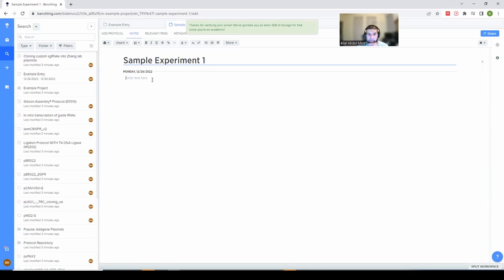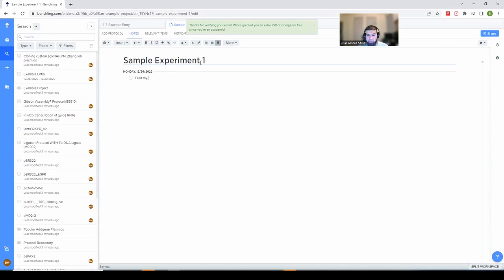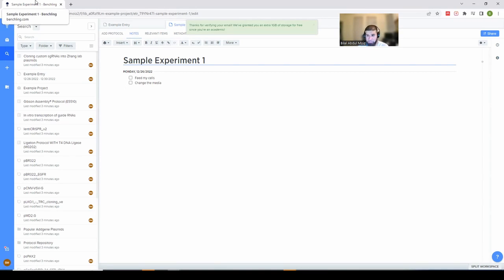For a sample experiment you can write whatever you want here. One thing I like to do if an experiment has multiple tasks is set up a checkbox and create notes like 'feed my cells, change the media.' Now, to give you a more realistic example I'm going to go over to my actual account, which has some templates. I'll blur out some experiments and details to protect our research, but I'll try to show you as much as I can.